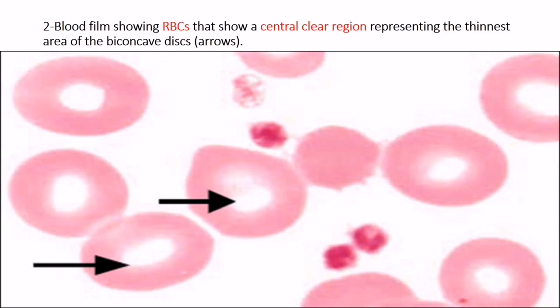Here is another blood film showing RBCs that display a central clear region representing the thinner area of the biconcave disc, marked by arrow.